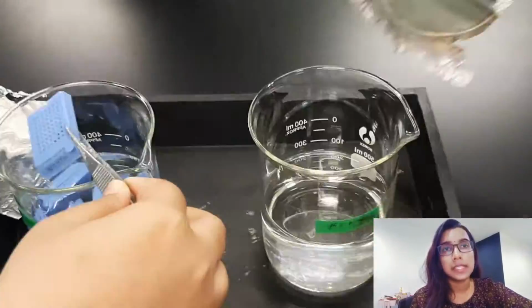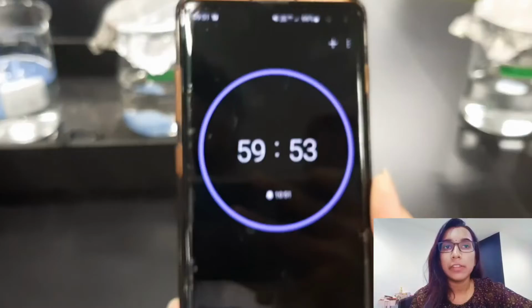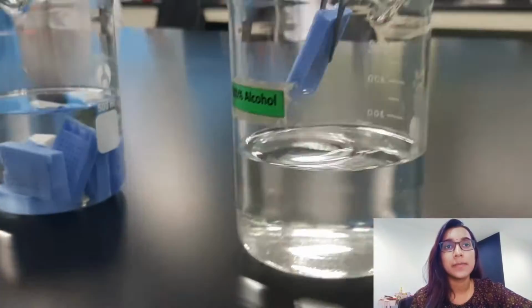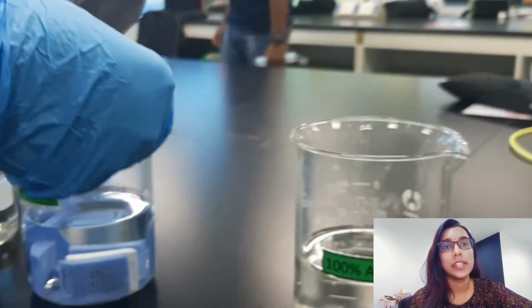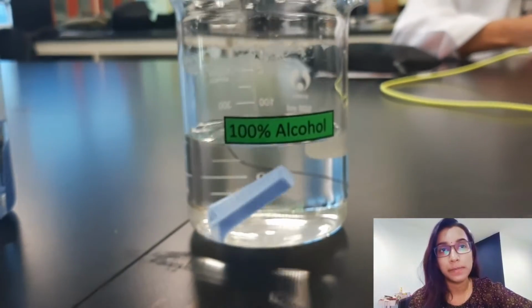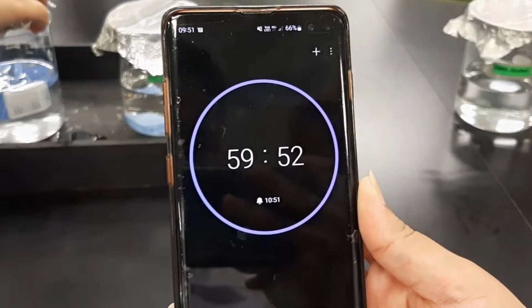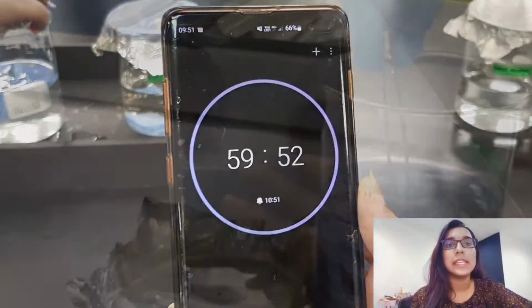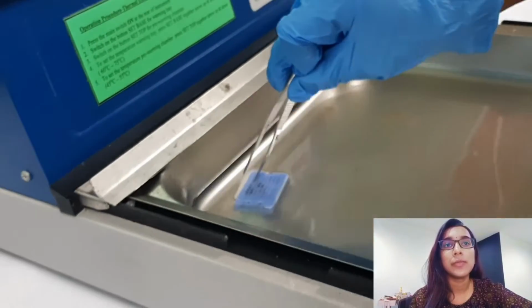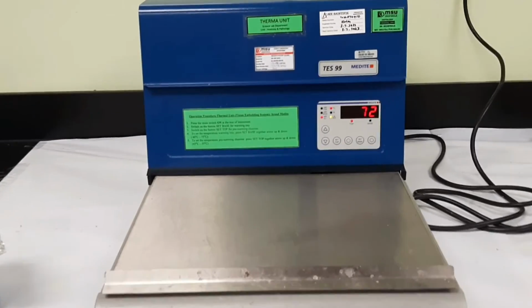In 50% and 70%, the alcohol immersion will be for 30 minutes, while in 95% alcohol, 100% alcohol twice, and xylene 1 and xylene 2, the immersion will be for 1 hour respectively. The infiltration will be continued by using molten paraffin for a certain period of impregnation.